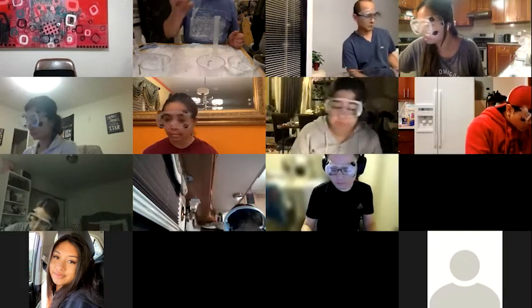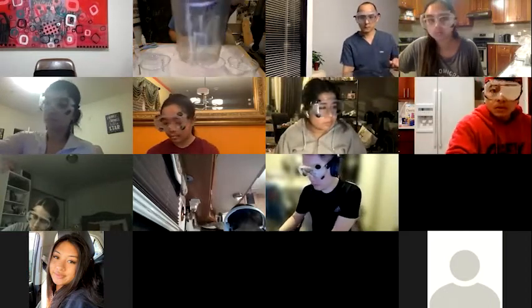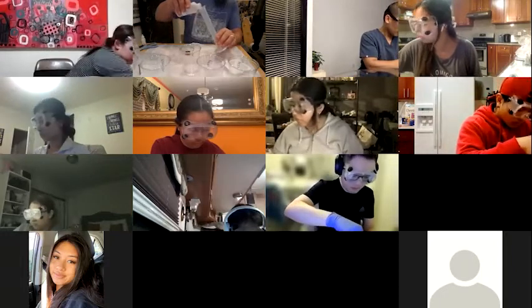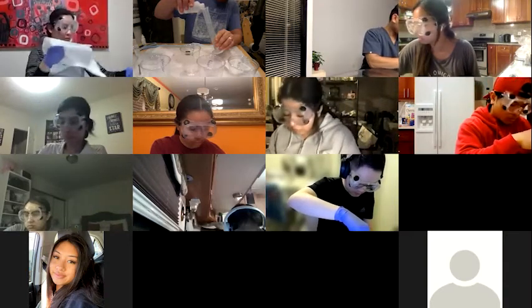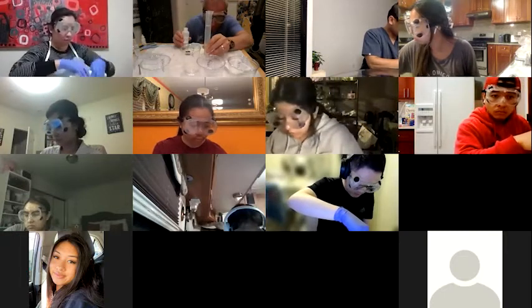So now I've got my 0.1 molar acetic acid, labeled a cup, 0.1 molar acetic acid, and I want 50 mils of that as well. Oh, 50 mils.